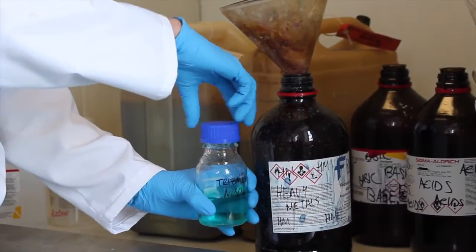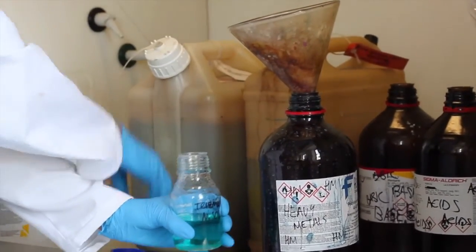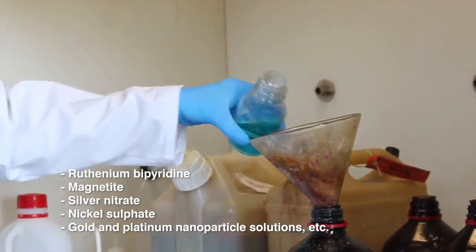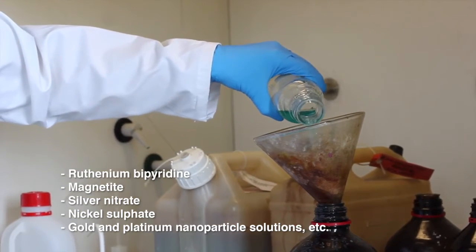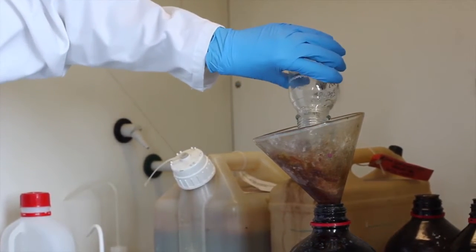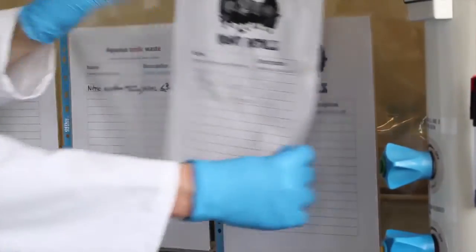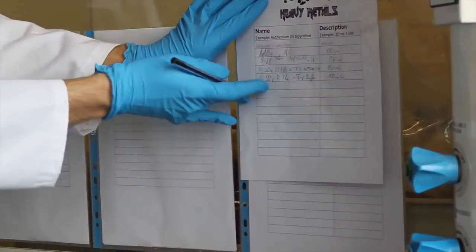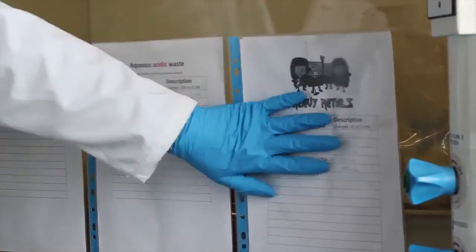If you're working with heavy metals, you'll be using this bin, the heavy metal waste container. Here you can dispose of all solutions which contain heavy metals such as ruthenium bipyridine, magnetite, silver nitrate, nickel sulfate, or gold and platinum nanoparticle solutions. Due to its toxicity towards living organisms and the environment, we have to ensure that we log every chemical component and their amounts on a list, which is also attached to the fumehood sash. Just write down the chemical name, the volume, and the concentration of the solutions you have disposed of. The same applies for both the acidic and the basic waste containers.